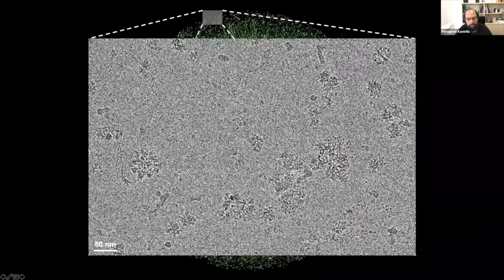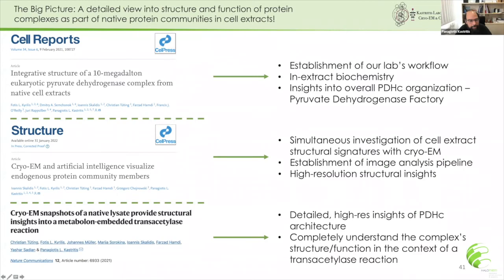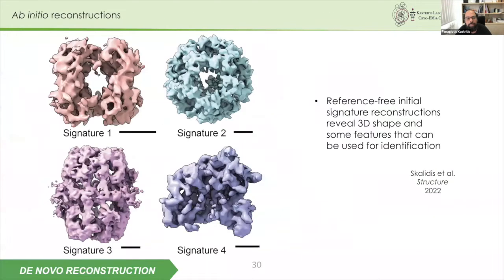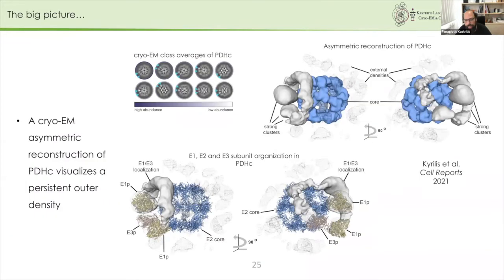So there are specific regions in the disordered linkers which fold in order to accommodate these kinds of subunits around. I can show you. They share a lot of common features, so they can undergo this disorder to order transition to bind the external subunits. So this is what is happening. I can go to this slide here.